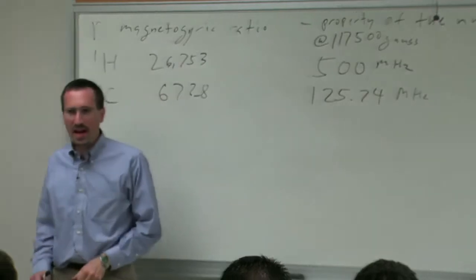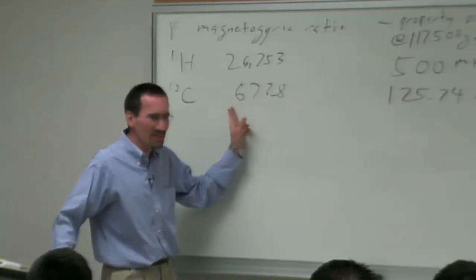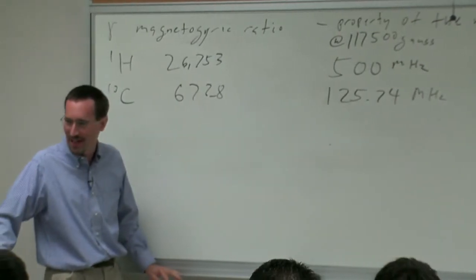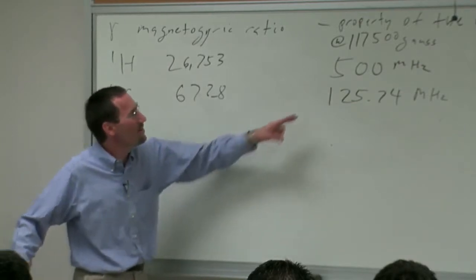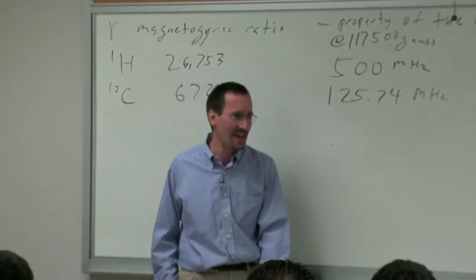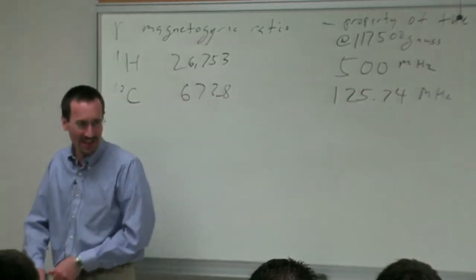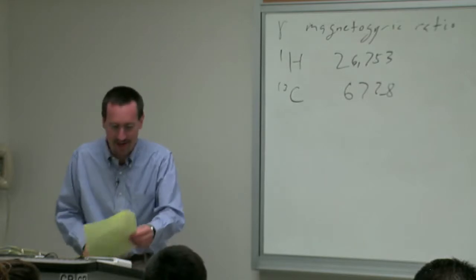Now, the other thing you have to remember is even though you're recording your C13 NMR spectrum on a, quote, 500 megahertz NMR spectrometer, you're not reporting your carbon NMR at 500 megahertz. If you were, you'd be that lucky person not in France, but maybe on Mars, who has access to a 2 gigahertz NMR spectrometer. And there ain't no such animal right now.